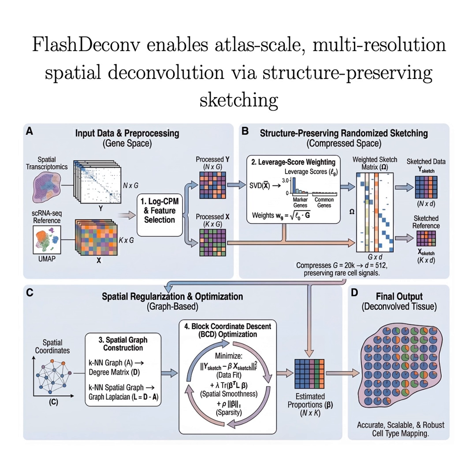And I imagine the spatial maps generated instantly would just light up, showing that tumor immune geography. They showed this striking inverse relationship. Regions that were just dominated by tumor cells in poor responders were the exact same areas where immune cells were totally depleted. This kind of rapid throughput transforms how you could use spatial data for, say, real-time clinical screening.